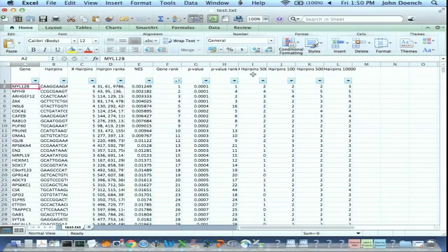Okay. Yeah, absolutely. What is the normalized enrichment score? It's weighted by your second best, and Dave, I can't do a good job of explaining NES, can you? Well, the weighted sum is what you talked about, just weighting the rank of the second best hairpin at 75% of the score, and the first best hairpin at 25% of the score.